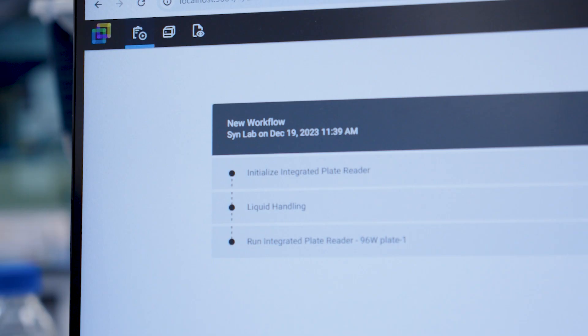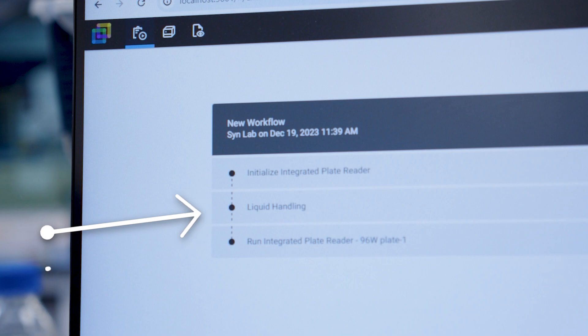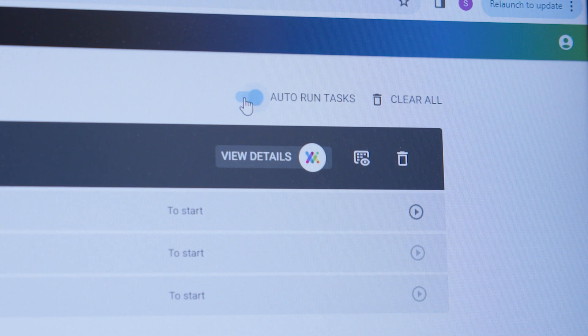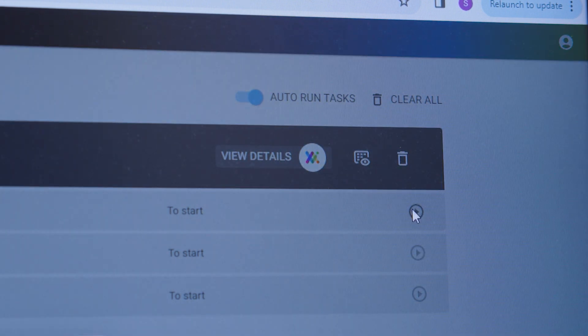Then back on Synthase Hub you'll see that the steps have been broken up into sections for example a liquid handling and a plate reading section. If you want to do all of these with no pauses just toggle auto run tasks and press play.